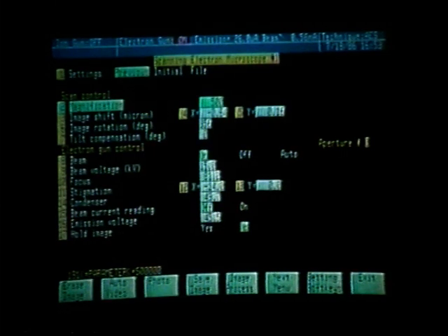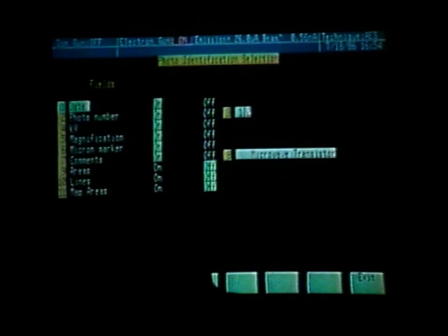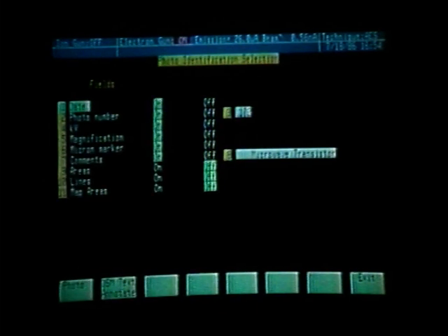To repeat the photo procedure, we exit from the SEM menu using the soft key number 8, which returns us to our home bank. We then go to Setup Photo, which is Shift and function key 20. At this point, we turn on the desired fields, fill in the desired comments, also fill in the correct photo number, and take the photograph.